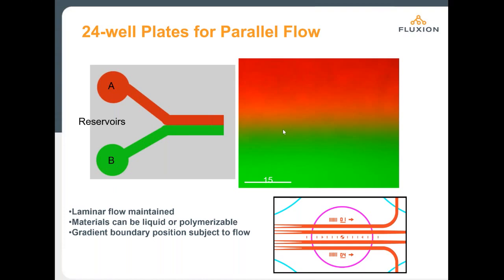And this was originally used for chemotaxis related to, say, for example, neutrophils or brain stem cells or brain tumor cells that we've seen before. More recently at Oxford, they described using this for bacterial chemotaxis towards things like endogenous pyocins and whether or not bacteria would be motile towards different chemical agents.